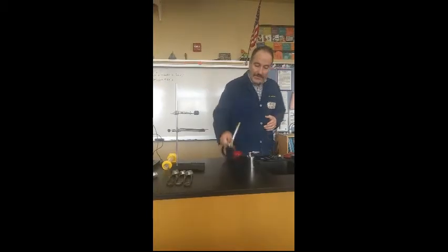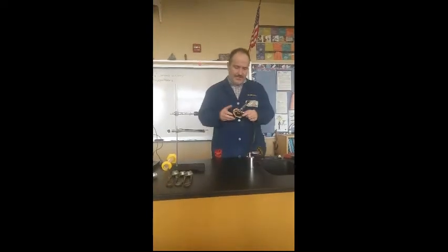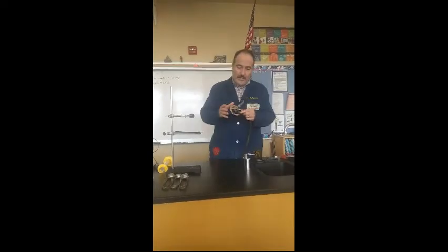Okay. Now this right here, this device, in my opinion, is what differentiates chemistry from all other classes. Let's put it this way. In this class, not only are you allowed to light fires, you're expected to. You try to light a fire like English class, they're going to expel you. So I want to make sure that you guys know how to use this tool effectively and safely.